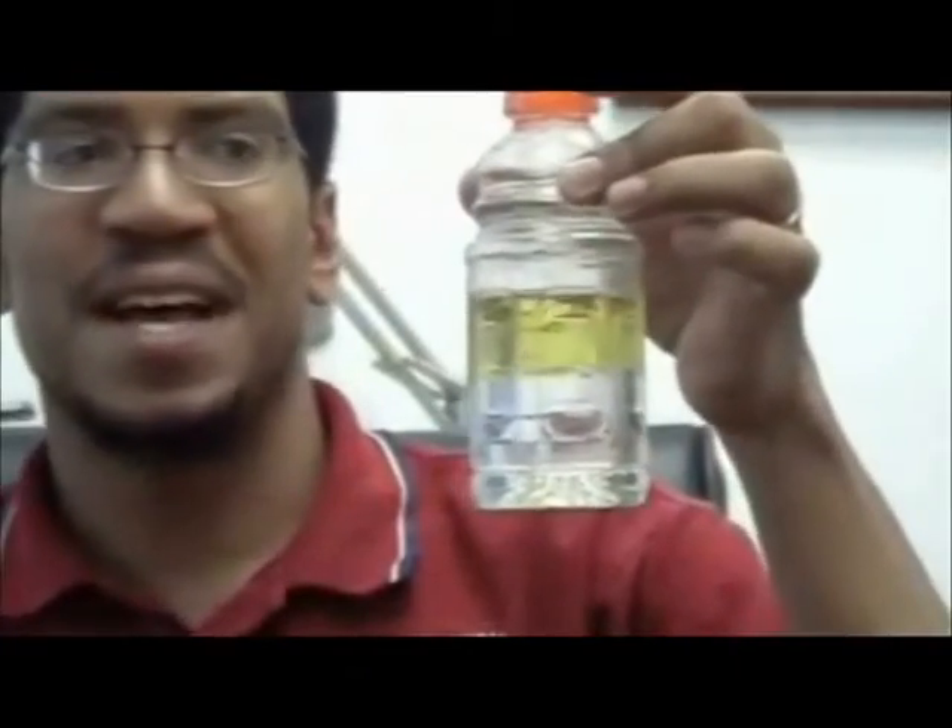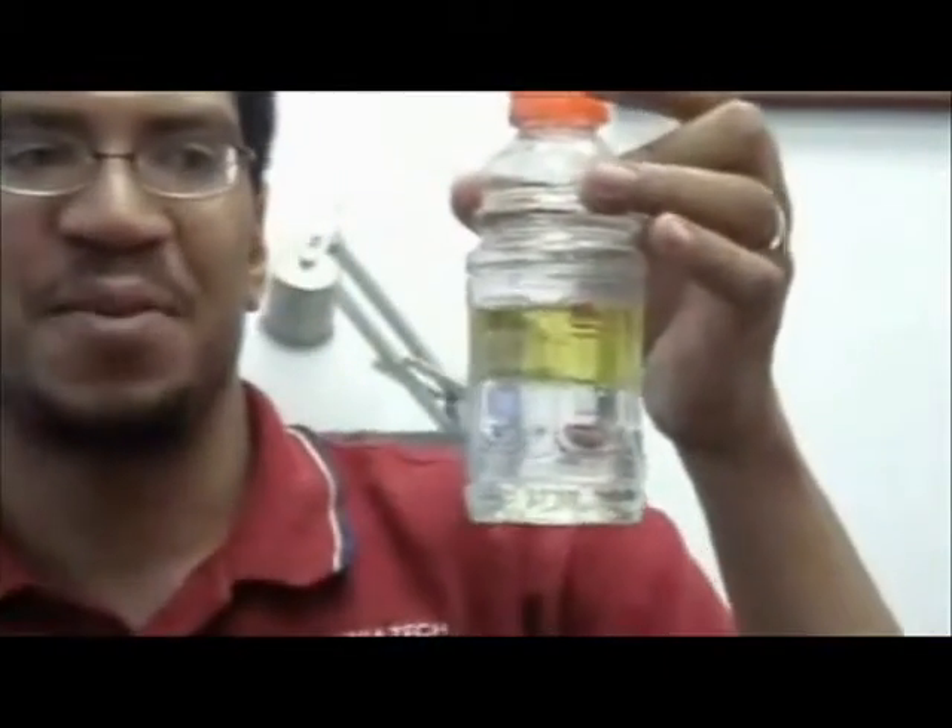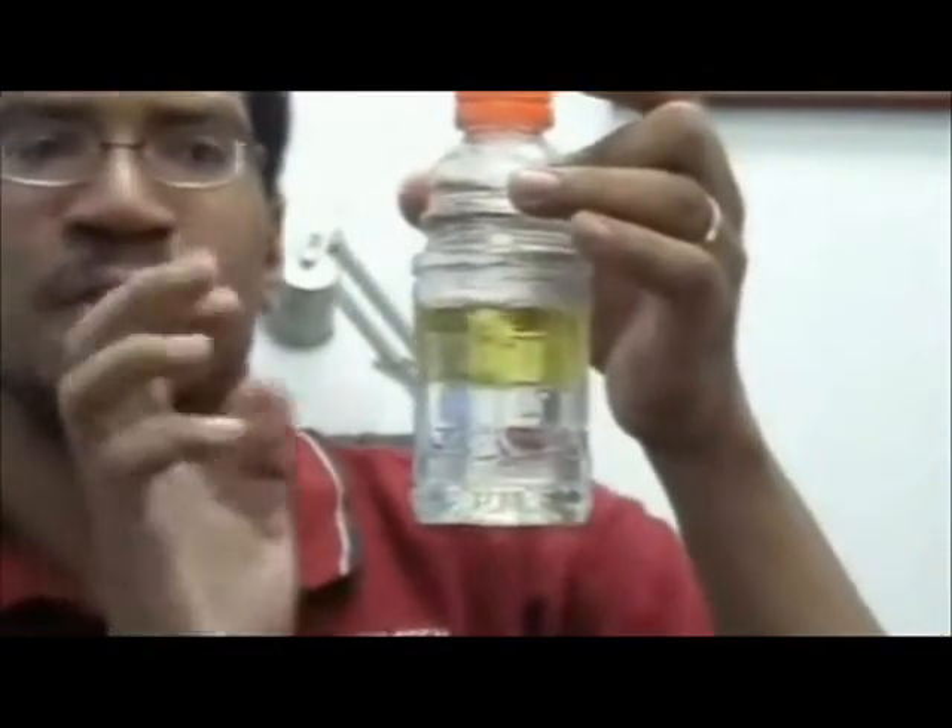Now how do we do this? In order to get these tiny little spheres or balls of polymer, what we actually do is use a technique based on an emulsion. So here in my hand I have a bottle of liquid. We've got water on the bottom and we've got oil on the top. Now everybody knows that oil and water don't mix. Oil floats on top of water.